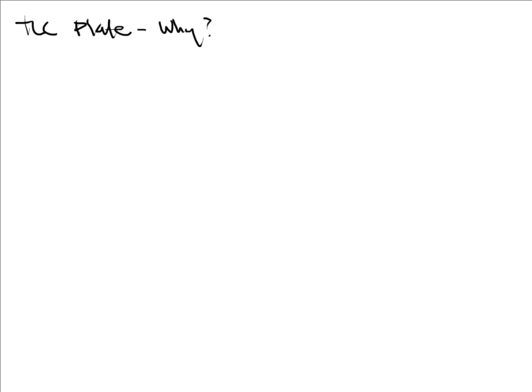We need to talk about why. Why does the TLC plate do what it does in a laboratory? Why does the TLC plate separate components the way that it does? And when I inject a sample, can I maybe predict which compounds will go up further and which would stay down below? Those are the questions that we're going to have to start answering.